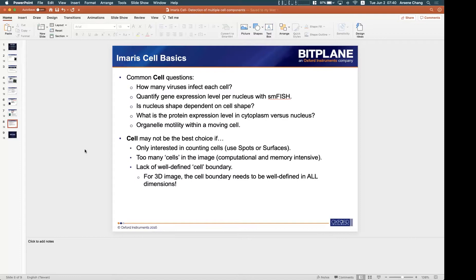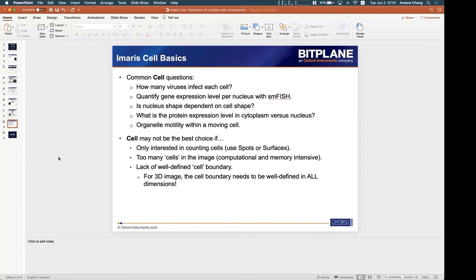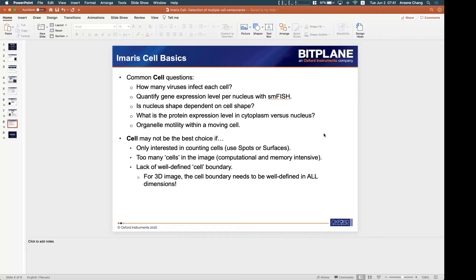But there are some cases which cell may not be the best choice. If you are only interested in counting the cells, I think using the spot or surfaces will be much easier. If you're just interested in the total number of cells in the image, we suggest you just use spot or surfaces for easier detection.